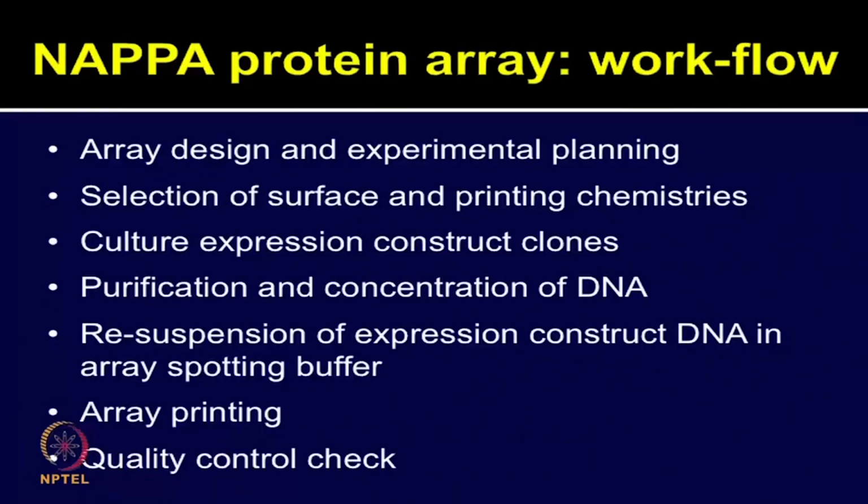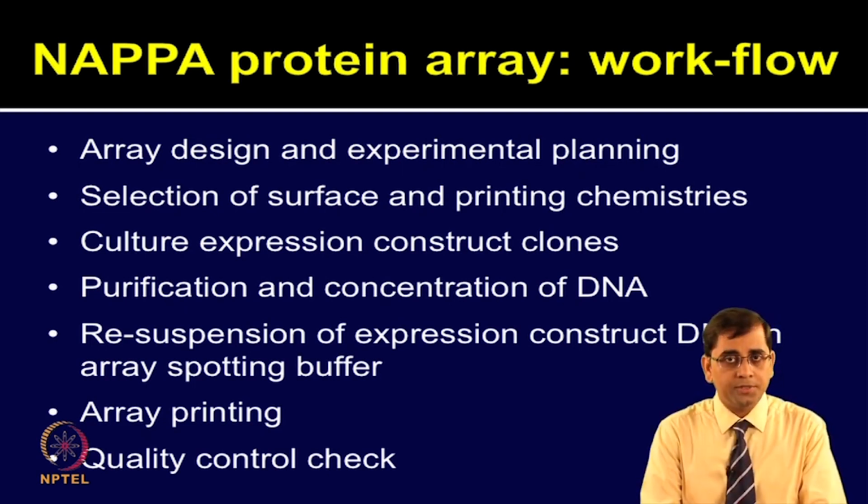Unlike other proteomic techniques, where one starts with unknown things to identify the protein by using mass spectrometry, in protein microarray, scientists are already aware what type of contents are printed on the chip surface to start with, and those contents have to be very well planned along with control features. If you have a specific objective in mind, for example, you want to study protein-protein interactions, you need to have some good positive controls for the protein interactors as well as some negative controls to rule out false positives.